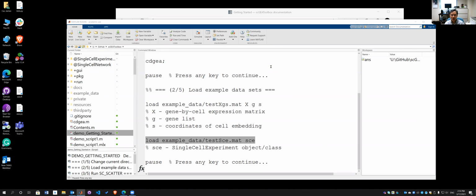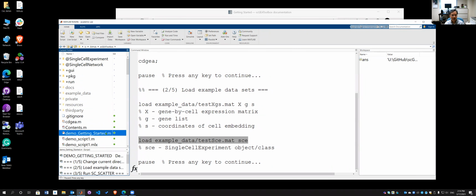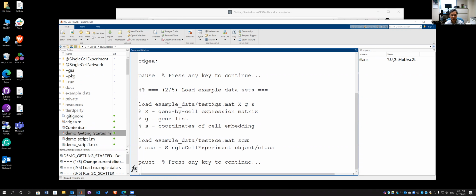Yeah, so you just use this to bring it up because there's a function already here. So this is just like a quick start. You don't even have to type this in the command line. You already let the script run. So we already have the first step, second step. Second step is to load this example data in. So we can click the next button.